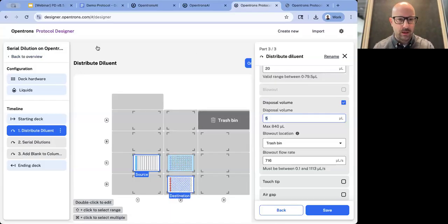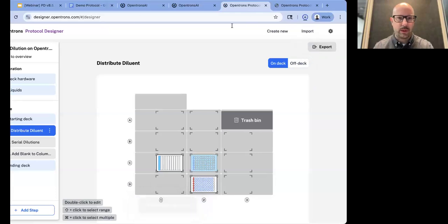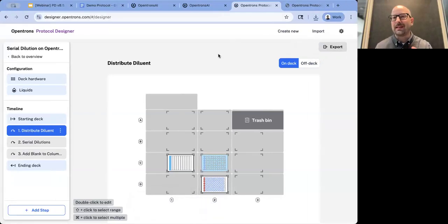So I'm going to keep going here. Okay, so I'm going to just export this protocol and then we're going to use it later. So just give me 1 second. Just exporting. Okay. Now I'm going to explain what the UX improvements were in the latest release. It's a lot easier to see it than just talk about it.